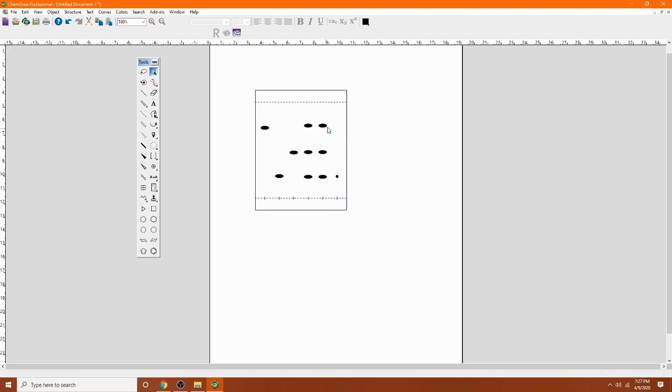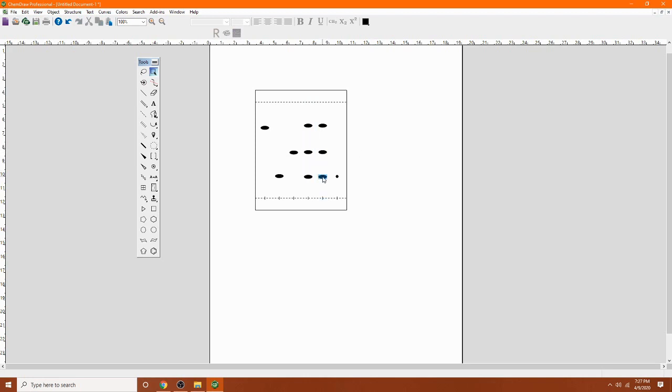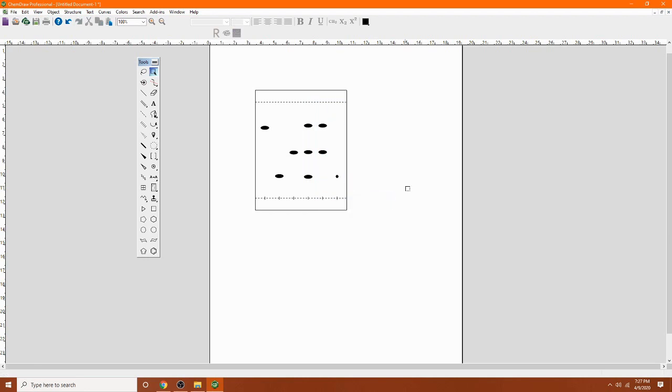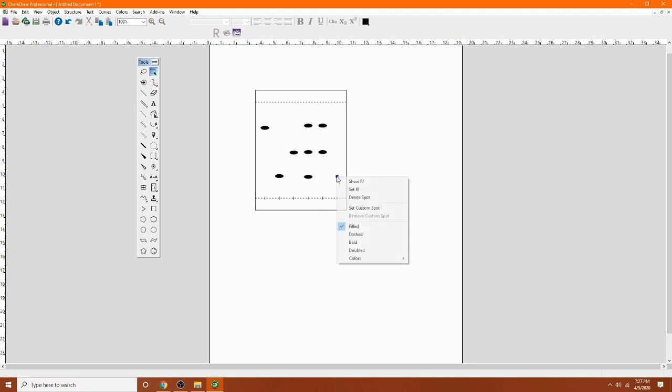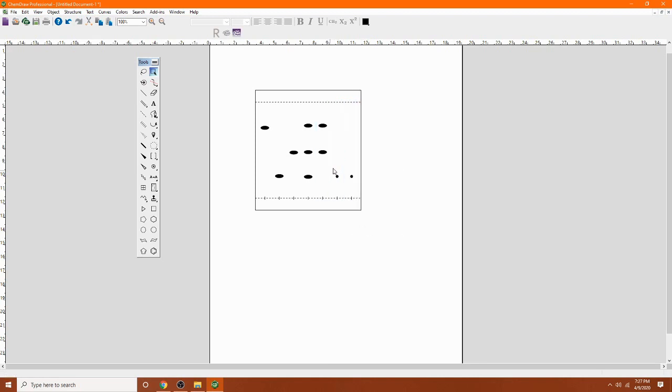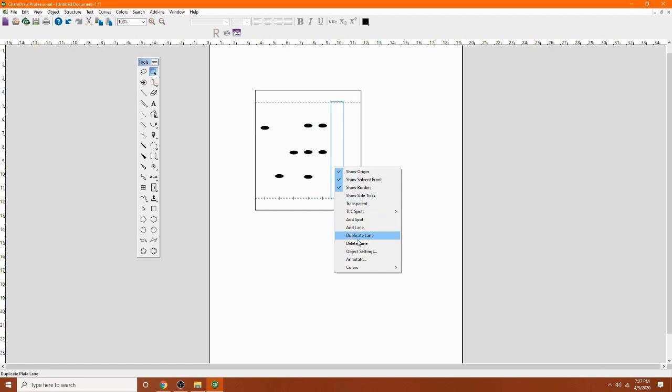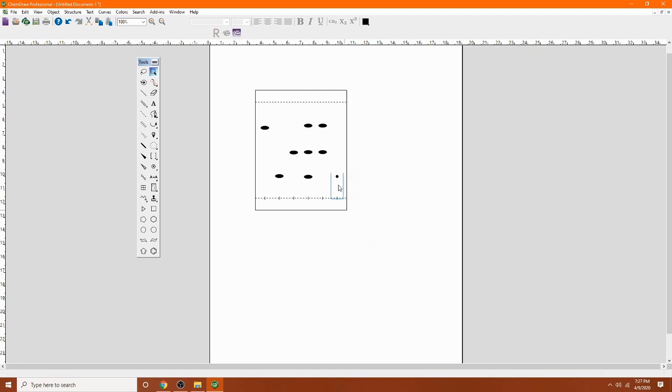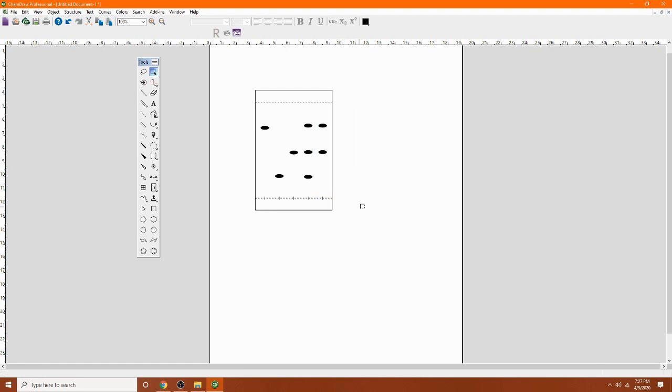But I have three spot here. So my unknown, let's say only have two components. So I need to delete out one of this spot. I'm going to delete this one out. Delete the spot. So then I can delete this lane out. Delete the whole lane. Delete the lane. So that's much better.